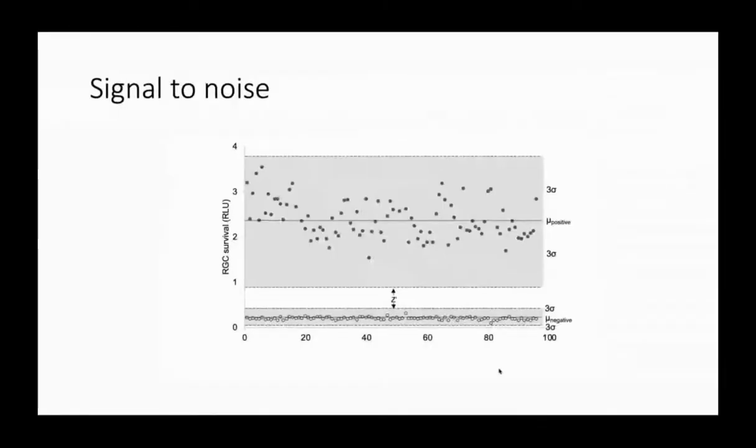But now that we know that, we can consider screening. We have this Echo-based system where we can do all this synthesis of gRNAs at small scale per well, which means we can do a lot of different wells and transfer things using the Echo and do screens. To prove that a screen was doable, we used the DLK gRNA in RGCs that are lacking LZK.